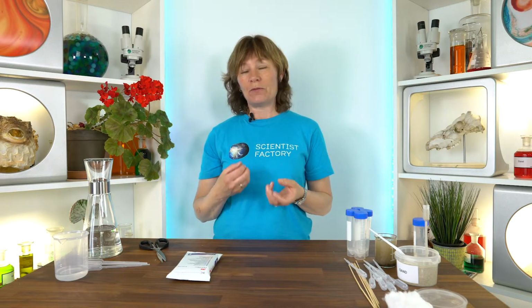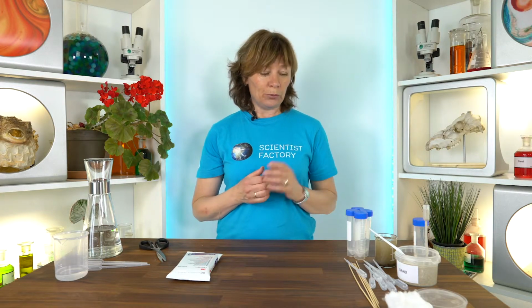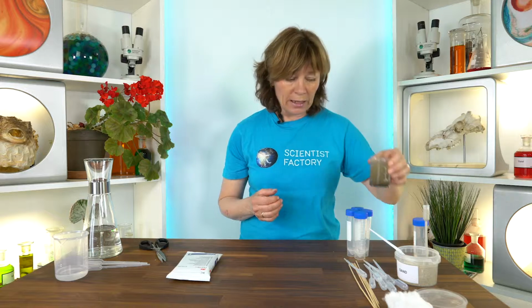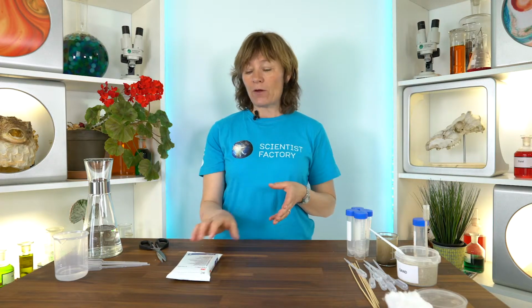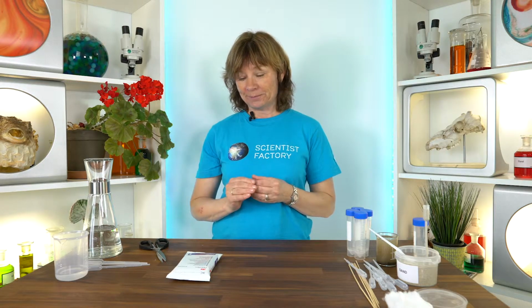Are they visible? And they're not, they are maybe a few micrometers big. So before we can see them, we need at least 100,000 or maybe 500,000 bacteria together in what we call a colony. Then we can see them with our own eyes. And in this activity, you will purify dirty water and you will see if you're able to remove bacteria. So before we can do this, we have to understand how we're going to grow bacteria and count bacteria.